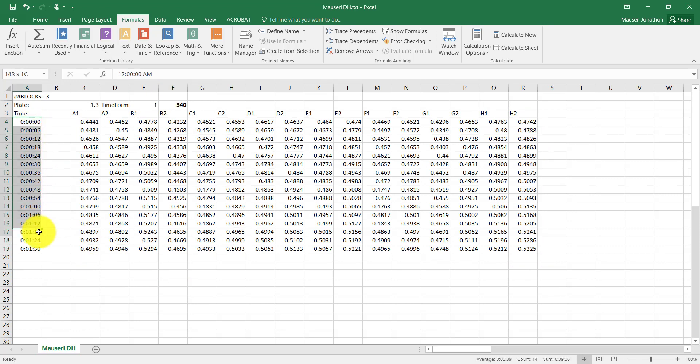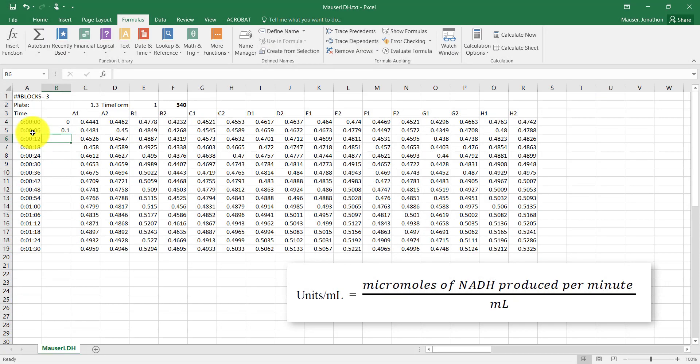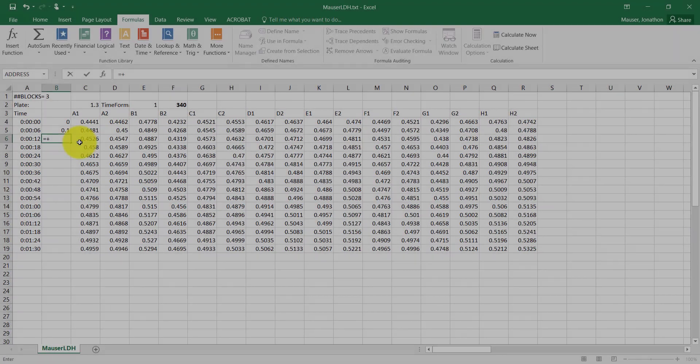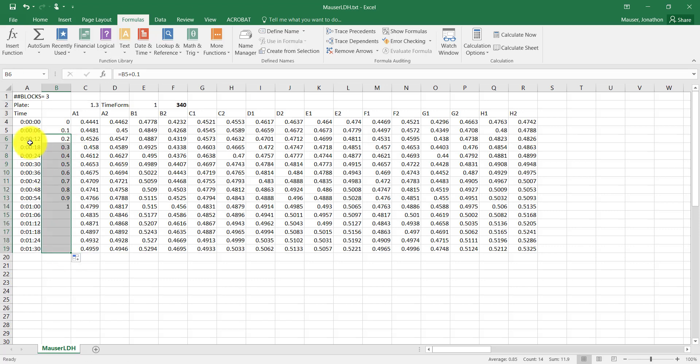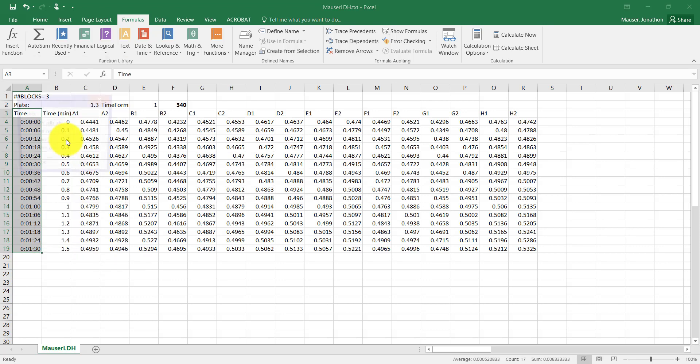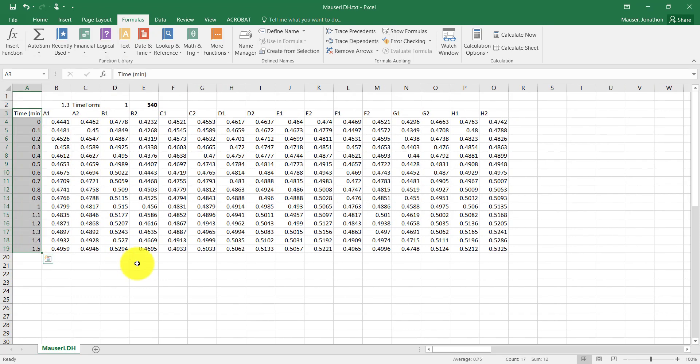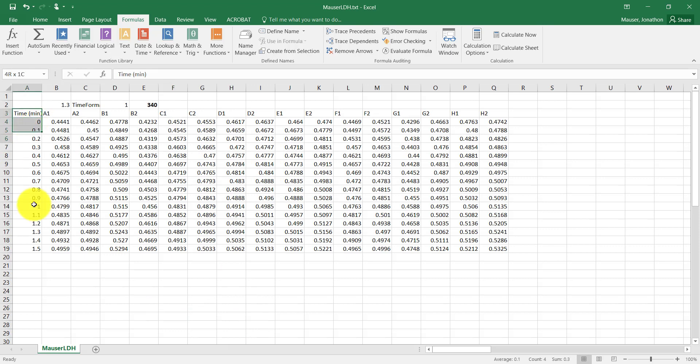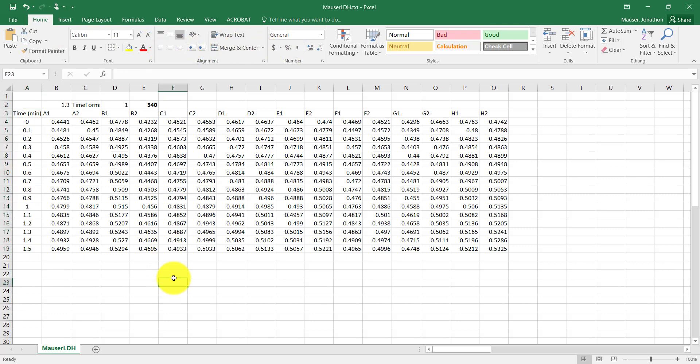Now the time this is giving to us is in 24 hour periods. And so what we need to do here is we need to process our data such that it gives us data in a normal per minute. And so at six seconds is 0.1 minutes. So since it's taking it every 0.1 minutes, I'm just going to make a little formula here that says add 0.1 every time. And I'll drag it down. Activity is always per minute. This is something you have to do every time. It's annoying, I know, but something we need to get so our units are correct. And it will make our life easier here when we have to do some conversions.